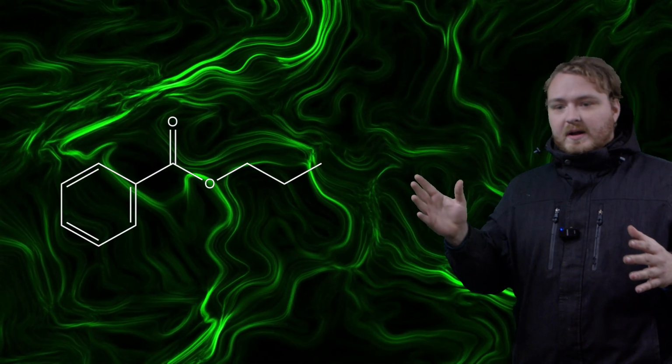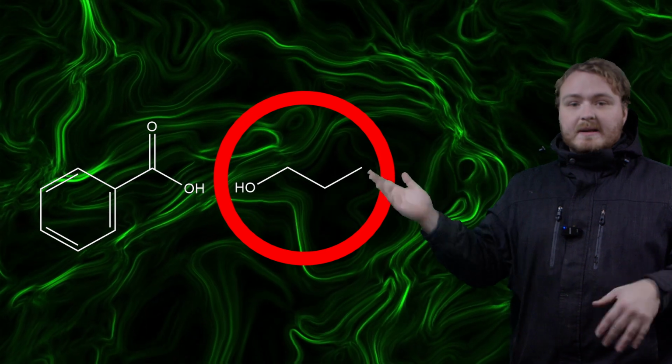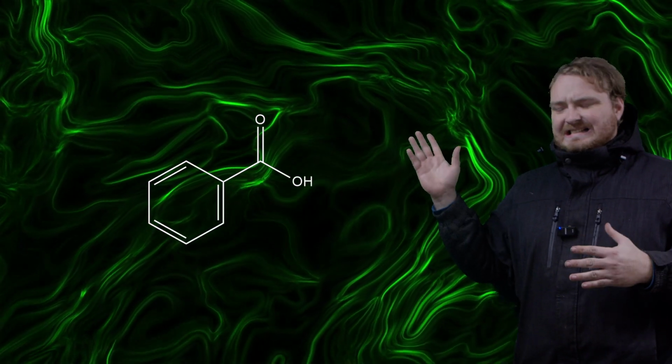So looking at the chemical, there's a lot going on here. But in order to figure out how we're going to make it, we need to reverse engineer it. In a sense, we're trying to decide what pieces we do have that we can use to make this final product. Right off the bat, I see an ester in the middle, and esters are very easy to make. You can make them by combining an alcohol and a carboxylic acid, and I've done this many times before. It's very easy, and I actually happen to have this propanol from another ester that I made in a previous video. The benzoic acid on the other side, though, I don't have that.